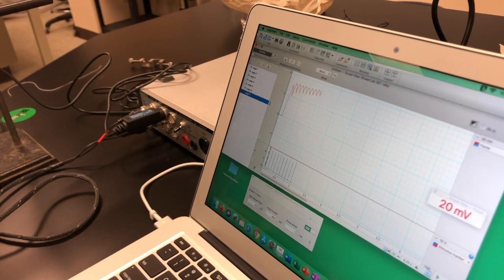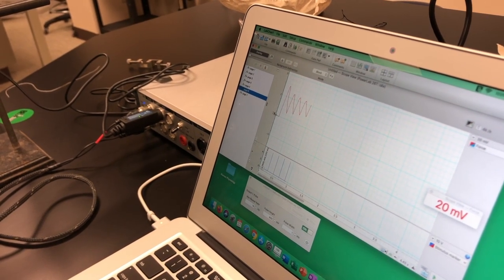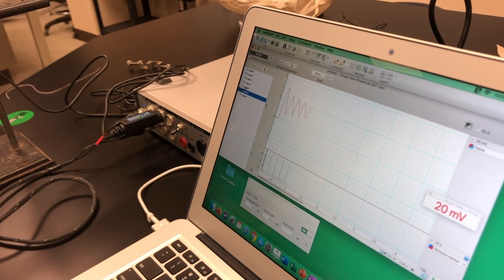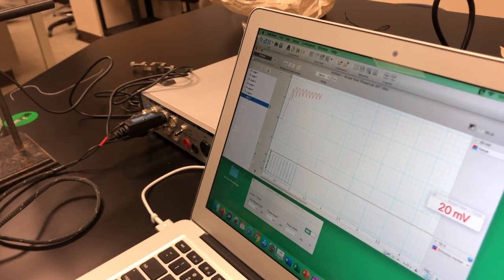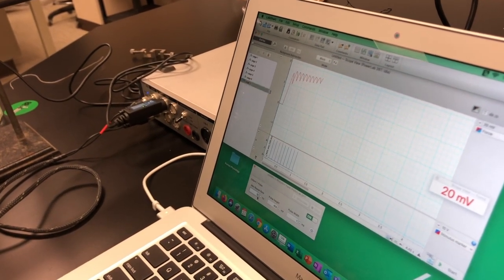So here you're getting to what is more or less, you can see individual waveforms. So this is summation. You can start seeing that in the last level here. It never comes back to rest. So this is summation. That was at 10.